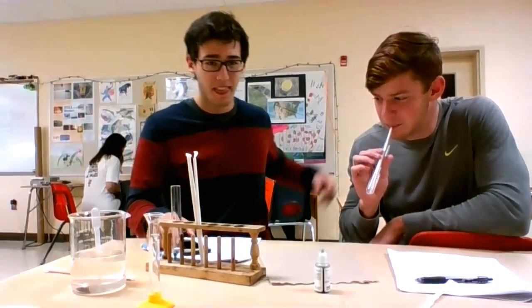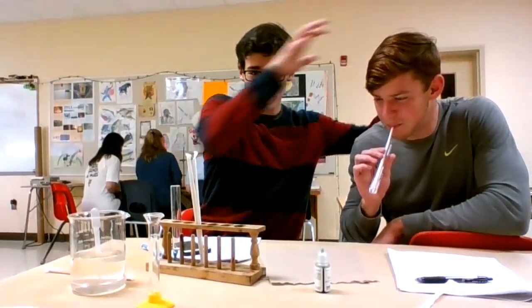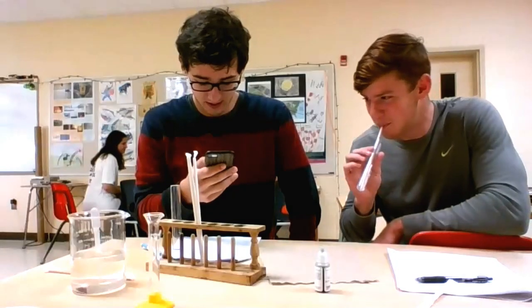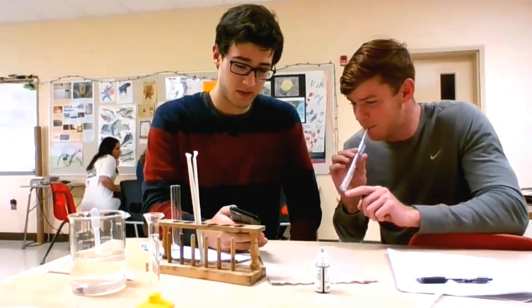Okay, do it fast, do it faster. There you go. Be careful when you pour that. You got this. 50 milliliters, big, huh? You need 25, right? Yes, 25 and 25.